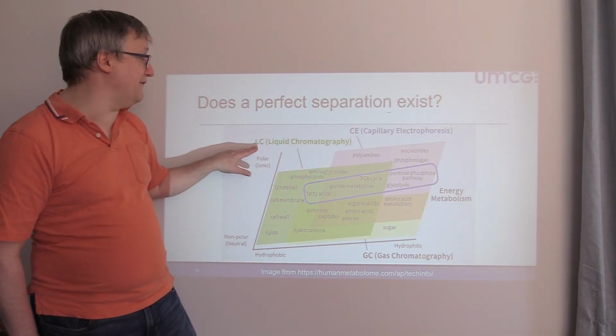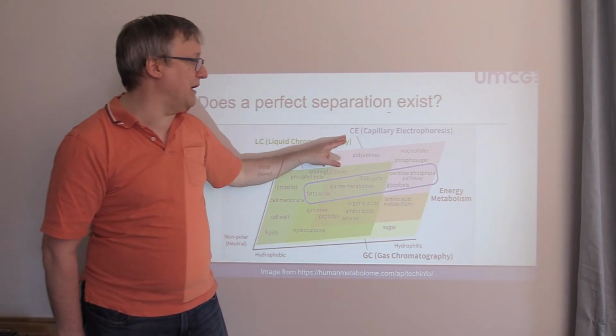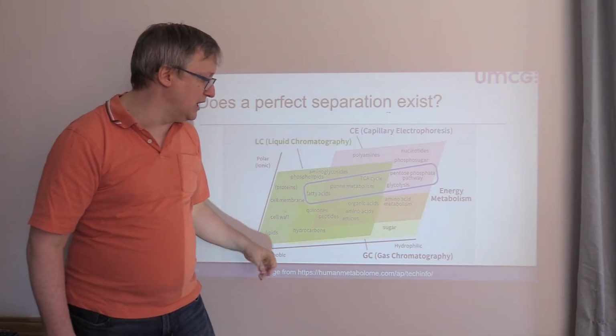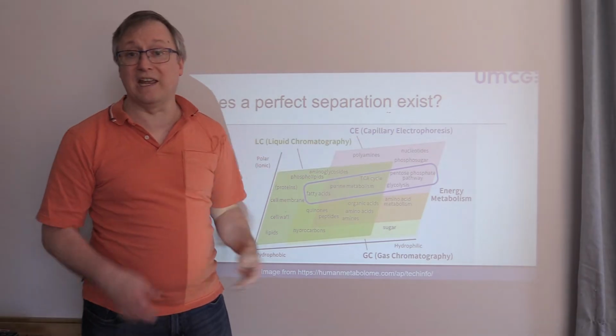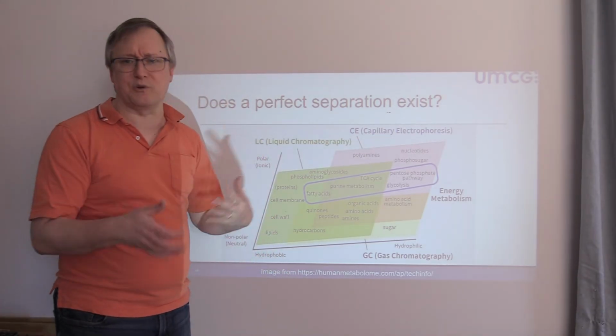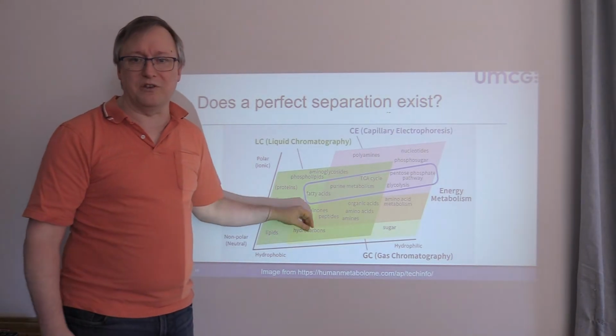Yes, you can do a whole lot of valuable things with liquid chromatography, but there are certainly kinds of compounds that you can really not deal with by liquid chromatography. And if you can't do it by GC, you're probably going to need to use something like capillary electrophoresis. But these three methods have different trade-offs, and different subsets of these compounds can be found by those three methods.